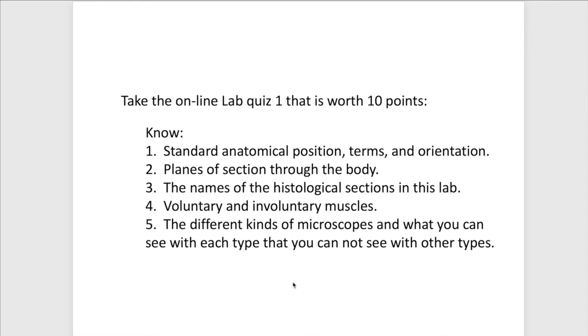If you're looking at viruses, you're pretty much looking at a transmission electron microscope. If you're looking at insects, I can use a light microscope, I can use a scanner, but if I want to look a little bit in 3 dimensions, then I'm really looking at the scanning electron microscope. So just know some of that detail, know how to interpret these things. These are just the basic tools. Understand how the same thing can look quite different depending on what kind of microscope you use to look at your sample. So, good luck on your lab quiz.